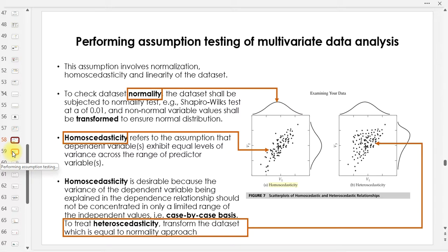That depends on your approach. For halal, I choose alpha 0.01. Environmental study, they prefer 0.05 only. If you want a less precise one, you can choose 0.1. If you choose 0.1, it indicates you allow 10% error, meaning that only 90% is correct. But in halal, I have to be strict. That's why I put 0.01 lah, because the topic is halal authentication. But we have to explain lah. Environmental study, they don't go to 0.01, they go to 0.05.